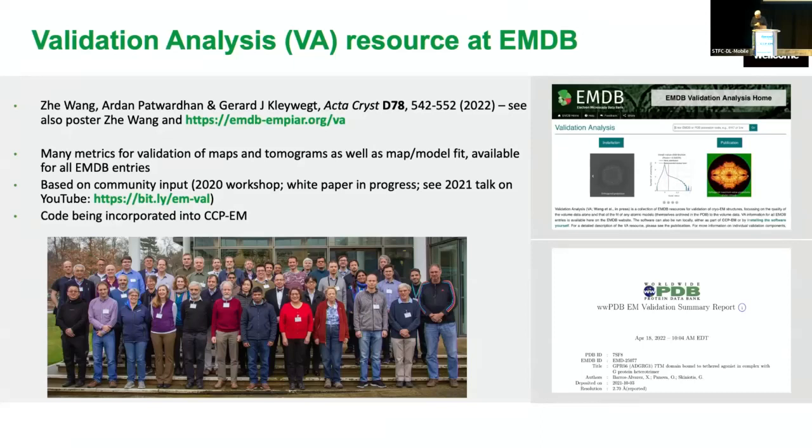Our work ends up being closely associated with organizations such as CCP-EM and EMDB, which help solidify consensus on things. And I'm now going to refer to the outcome of a meeting, which was a new validation task force hosted by the EMDB and worldwide PDB.